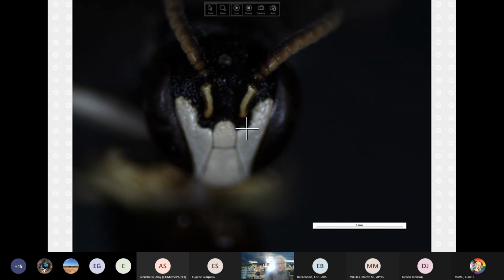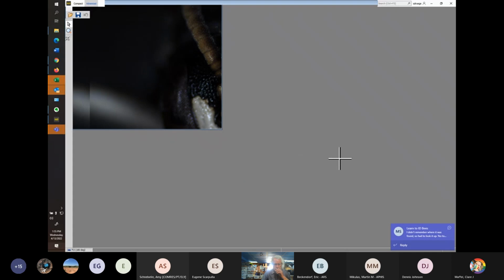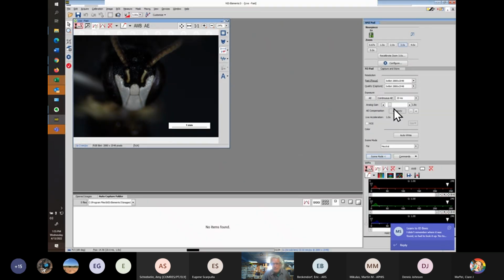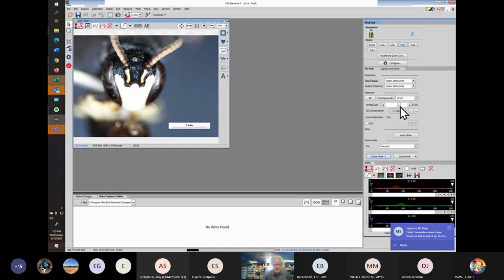There's a variability I've seen. There is a scape, which I believe is narrow. We will play with the lighting with the yellow on the outside, and let's jack up the lighting so we can see our scape there.